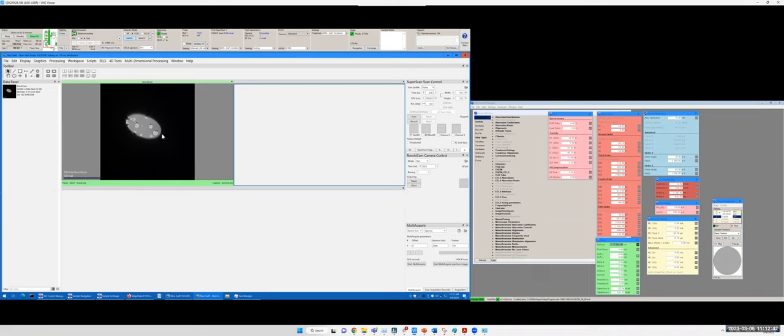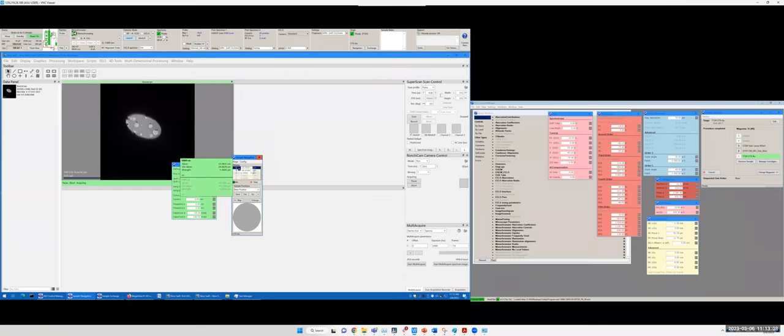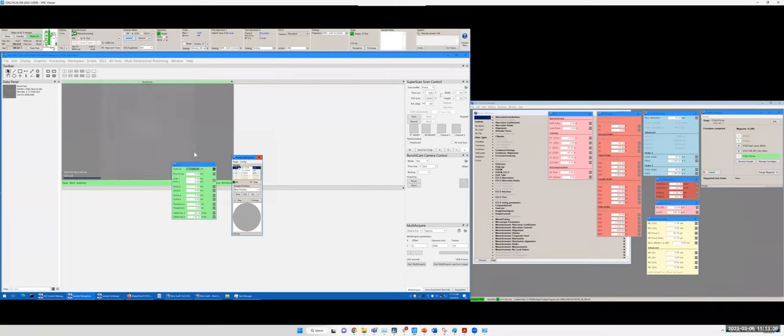Especially for fresh users, the only thing you want to check is whether the beam is blocked by the holder. Let me show you. The holder can block the beam. Let me move around. Okay, now the beam is blocked by the gray bar on the copper grid. So when you click beam on, you don't see anything. That's the only occasion you need to worry about.